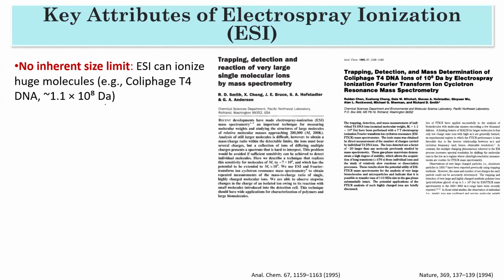If you ask me for the best ionization method, I can say ESI is best. Soft ionization methods are always best, because most probably they will give you the molecular ion peak. But if you go for EI, you may not get it.